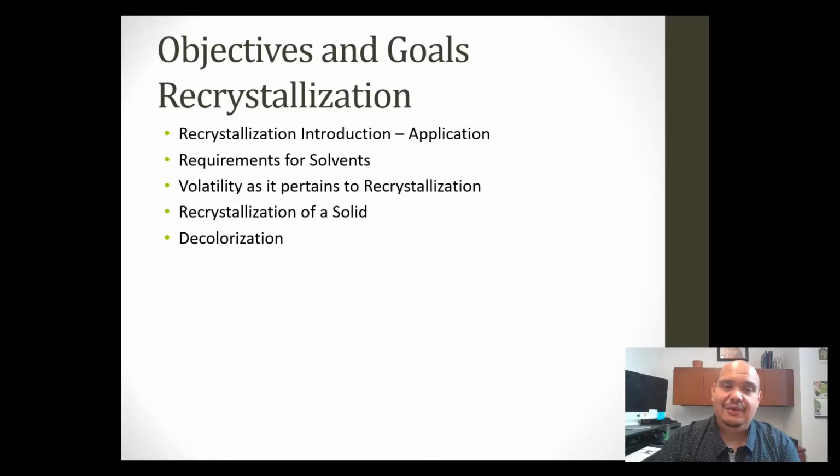Finally, we're going to talk about the principle of decolorization and how that helps us if we recrystallize a compound and it still has impurities trapped inside of it. We will discuss what an impurity is also. So, without any further ado, let's move forward.